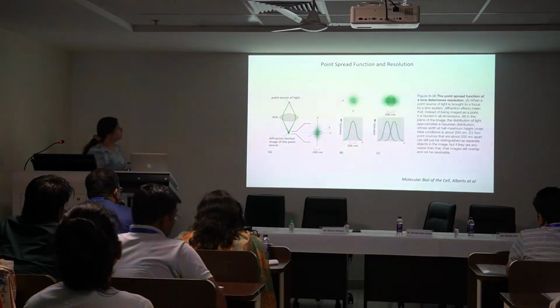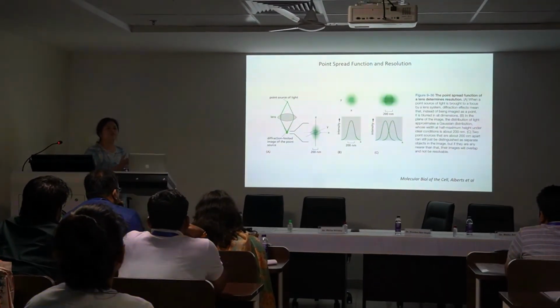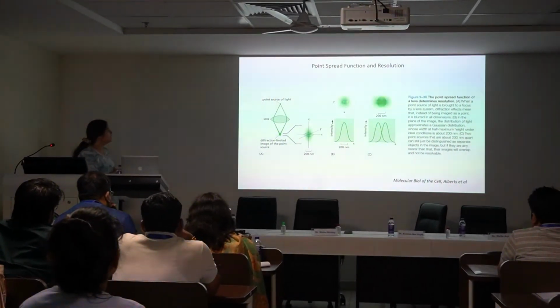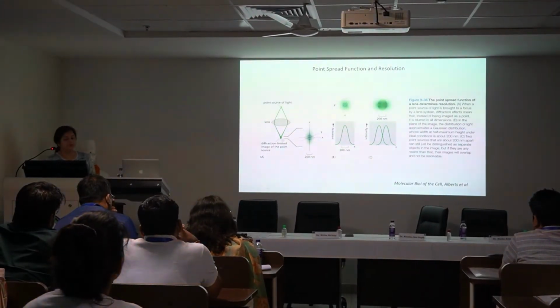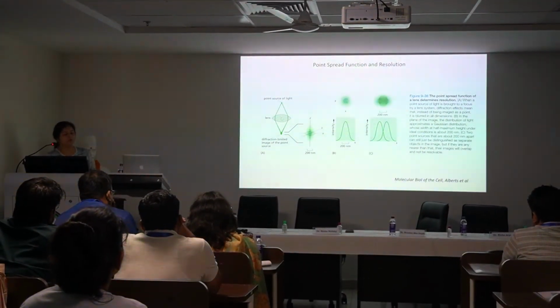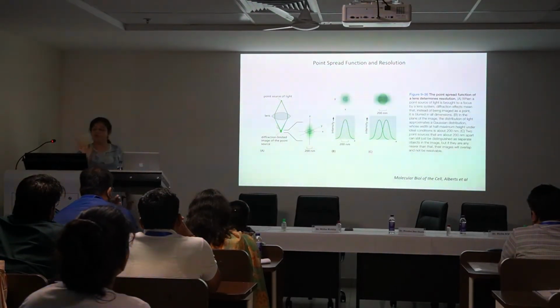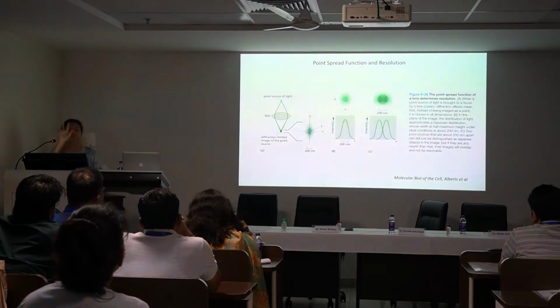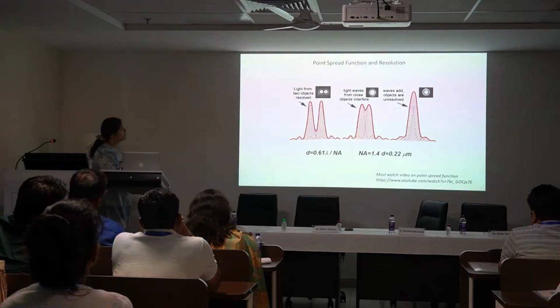Because of interference of light, because light is a wave and not a straight line, this point is diffraction limited. It is diffraction limited also because of the kind of lens that we can put there, and because of the refractive index. I'm not going into the theory of this; physicists will know this a lot more in detail.